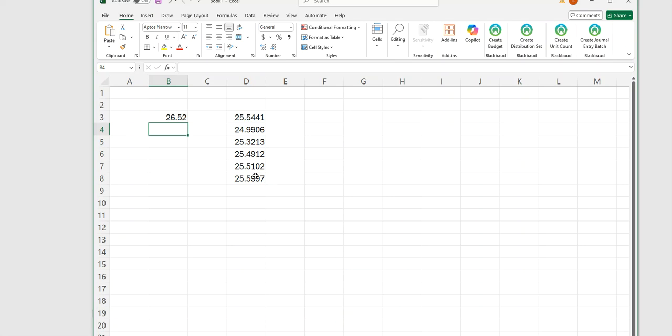So it looks like we need average and standard deviation. I'm going to go through the Excel piece just as a quick review. I think it's always good for you to hear this kind of stuff. So here's the data. There's the 6 data points, and I need to calculate the average first. So I'm going to key in AVERAGE, and put that label here, so that way I know what that number is supposed to represent.